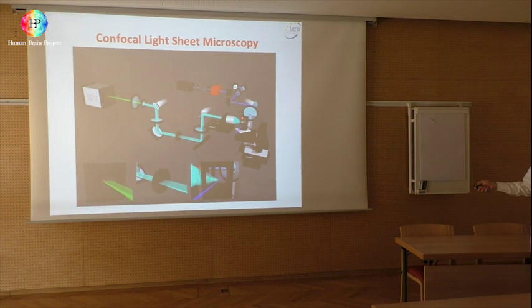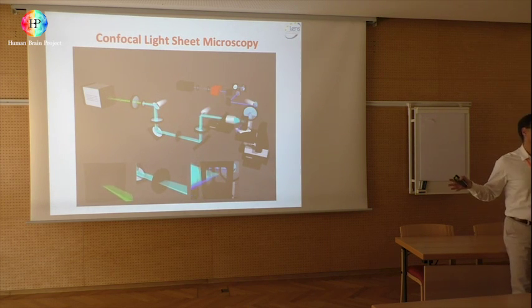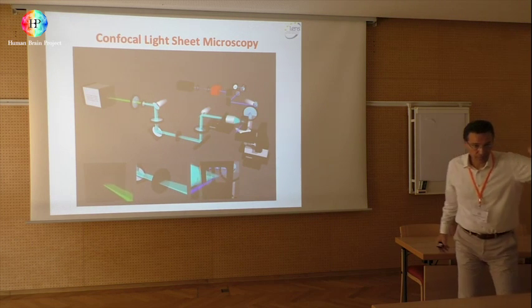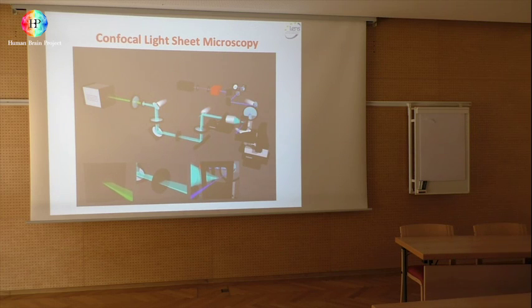Here in this chamber is the brain which is rotated, and every one of these positions is synchronized with this mirror in one slit here. So this is a pivot point, a fixed point. This is a confocal slit. So you remove the scattering in this way. Even if the brain is not totally transparent, you can remove the scattering. And we call this confocal light sheet microscopy.